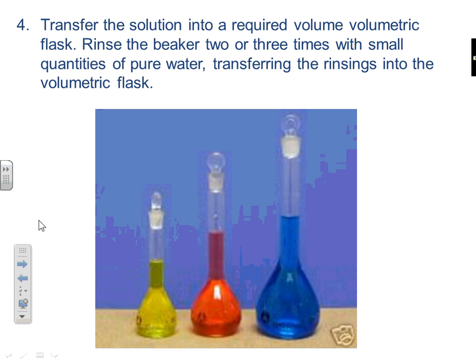transfer the solution into the required volumetric flask. So you'll then pour that solution and you will use a funnel. Again, I'm going to show you the video on how we're going to do this properly. This video that I found comes from a college somewhere in the States, but it's an excellent video because it shows the technique perfectly. It's actually an excellent technique.